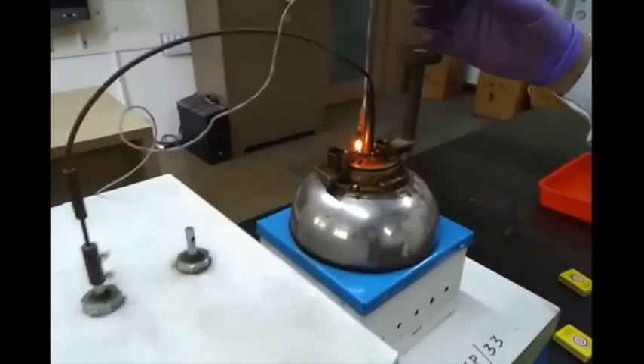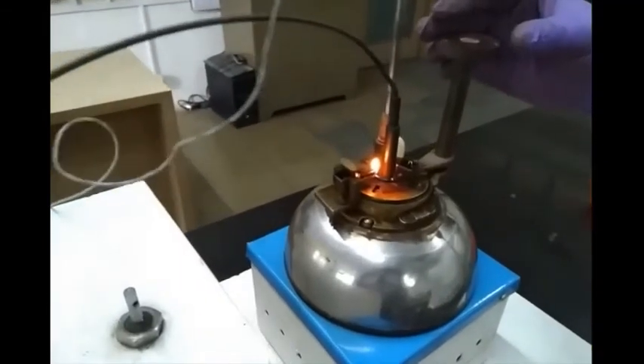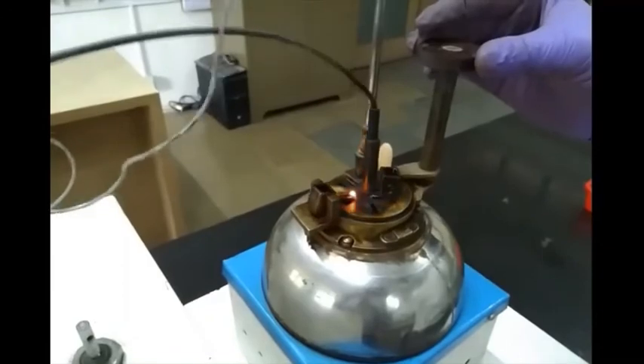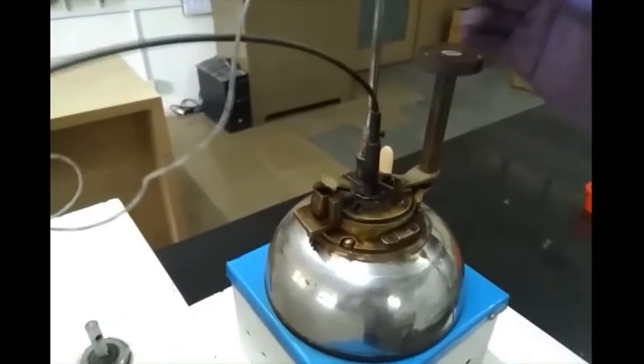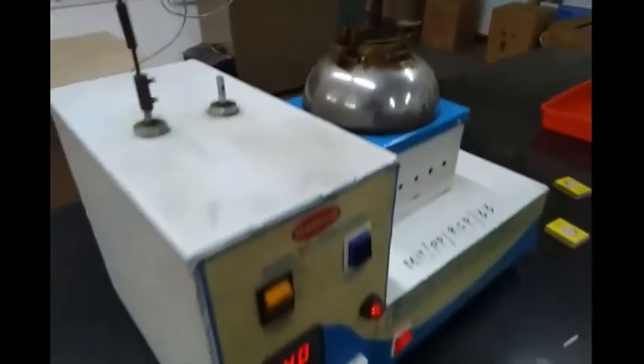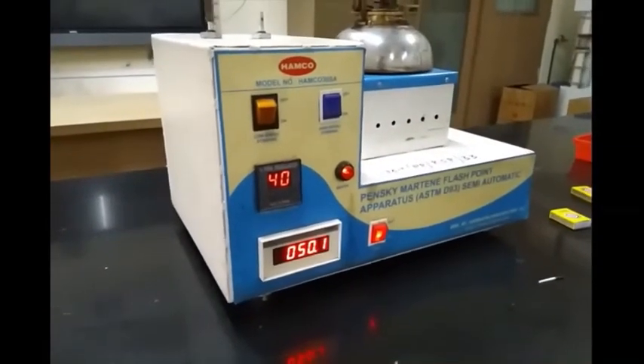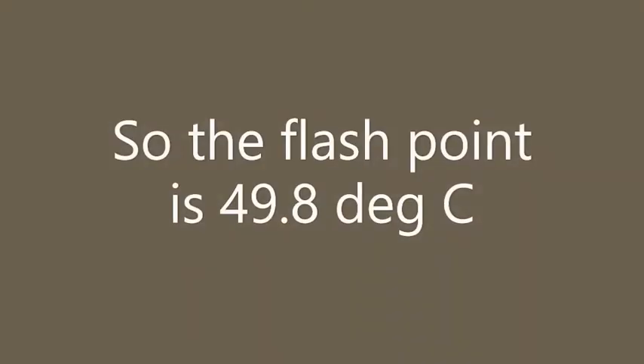Let us try it once again. We have ignited the flame and dropping it. Yes, this is the flash that we observe, and this temperature we note it as the flashpoint. It was around 49.8 degrees Celsius, and that is noted down as the flashpoint.